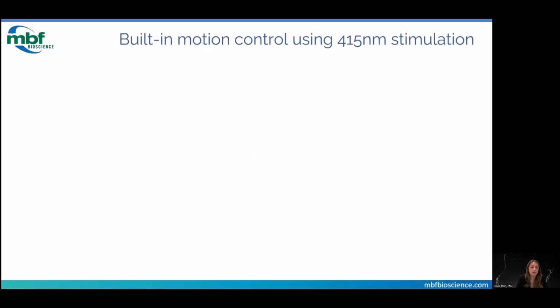When we're using brain signal to control hardware, it requires us to do some real-time analysis. And one thing that's really common in photometry experiments is that you get a slow decay shape in your signal from photobleaching. If we were to take those numbers and use them to control hardware directly, what you would get is a slow decrease where nothing ever happens. And so what we need to do is first correct out that shape. And the way that we can do that is using a built-in control.